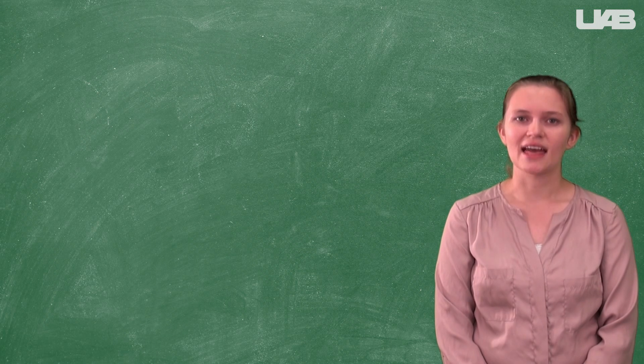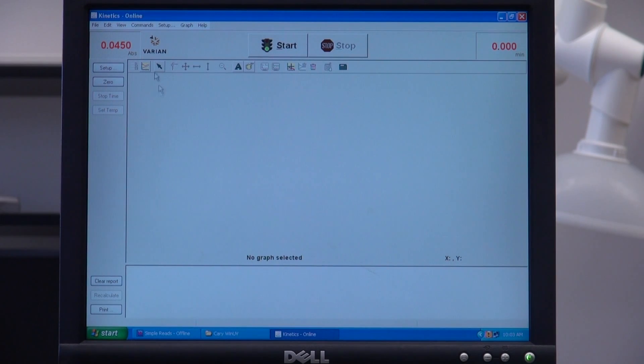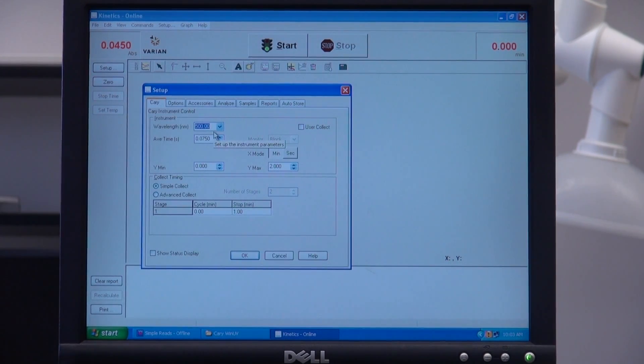This week we will be using the kinetics program on the spectrophotometer. Select Setup and set your wavelength to 560 nm. Hit OK.